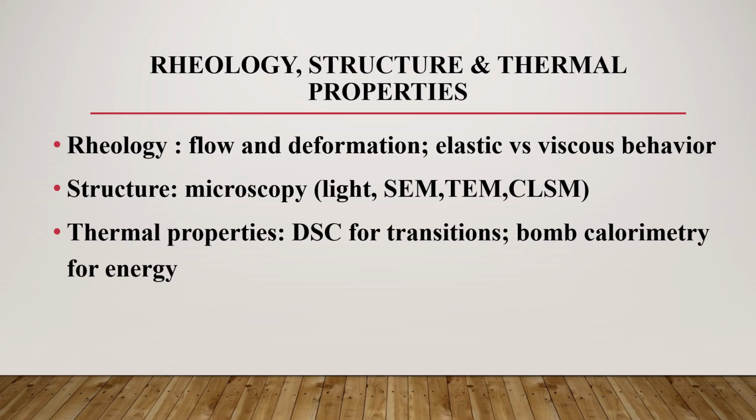Rheology, structure, and thermal properties. Let's look at how food behaves physically. Rheology is the study of how food flows and deforms. It's important for texture, shelf-life, and processing. Foods show both elastic and viscous behavior, measured using tools like viscometers and shear tests.